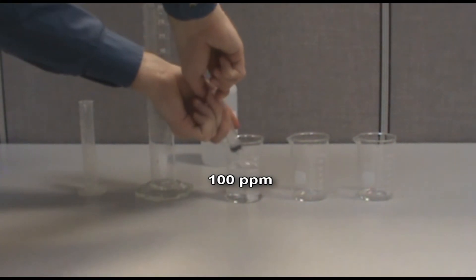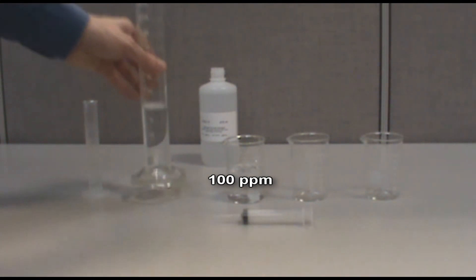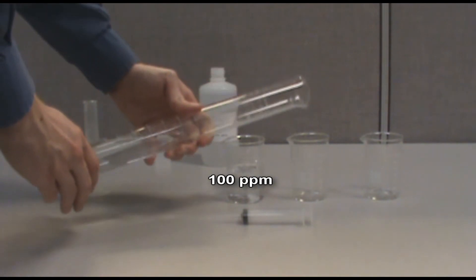Now measure out 10 milliliters of your 100 part per million standard using your pipette and graduated cylinder. Then measure out another 90 milliliters of DI water and combine both solutions in your second beaker.